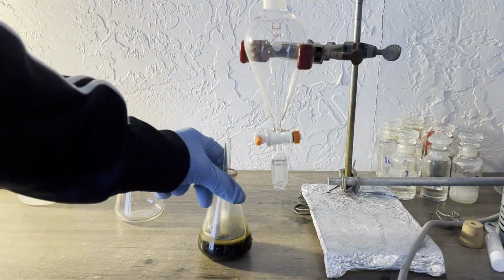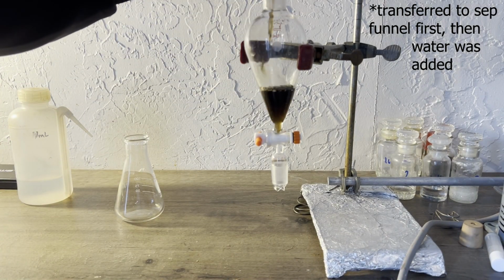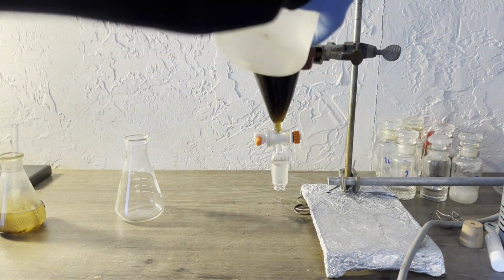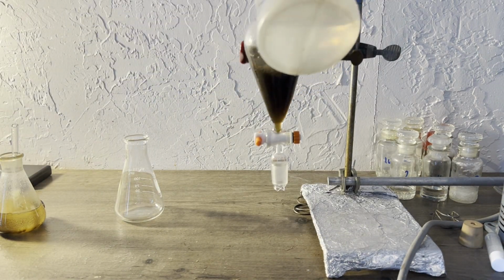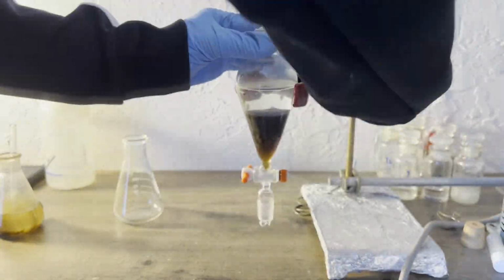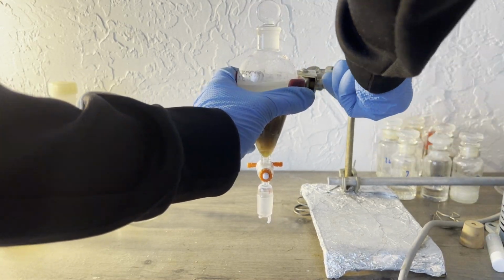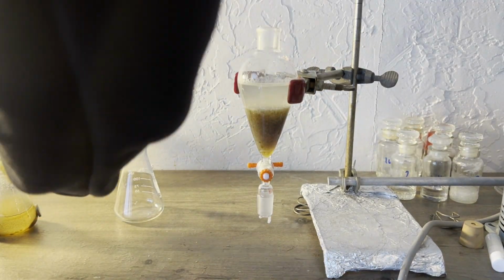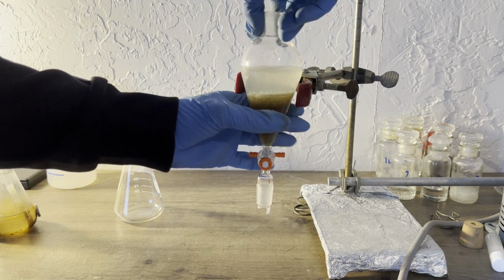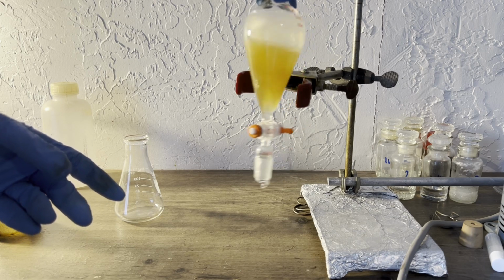After the chlorine addition was completed, water was added to quench the anhydrous aluminum chloride, and everything was added to a separatory funnel. The bottom layer is organic, chlorobenzenes and dichlorobenzenes are denser than water, the top one's aqueous. I am not completely sure why the organic got significantly lighter when I washed it with water, because the water layer stayed the same color, but I'm always glad when something that's supposed to be clear isn't brown anymore.